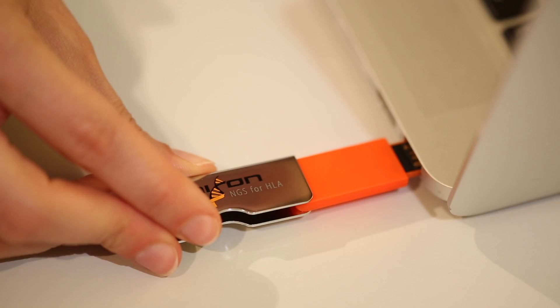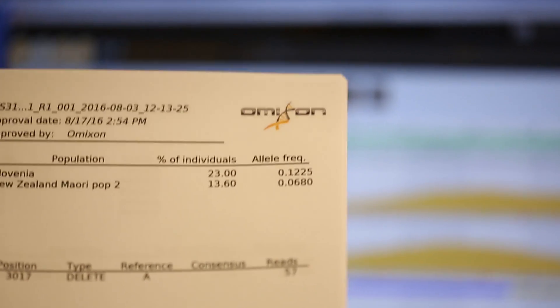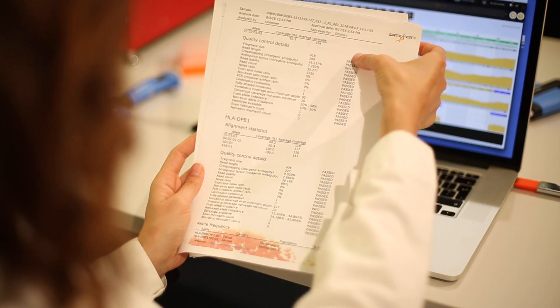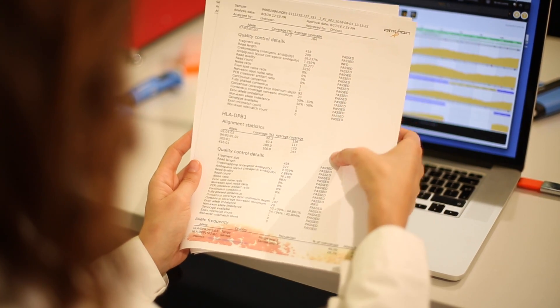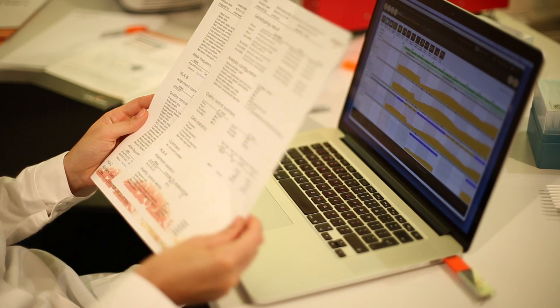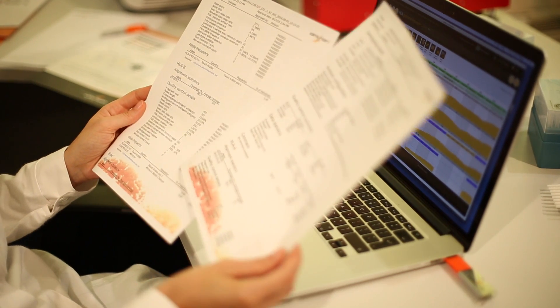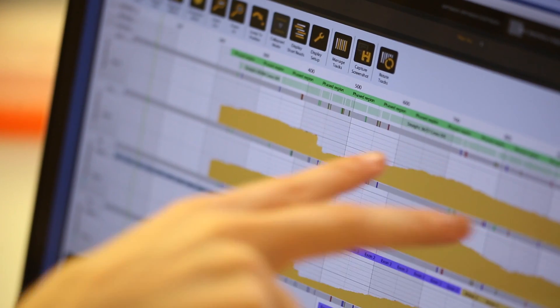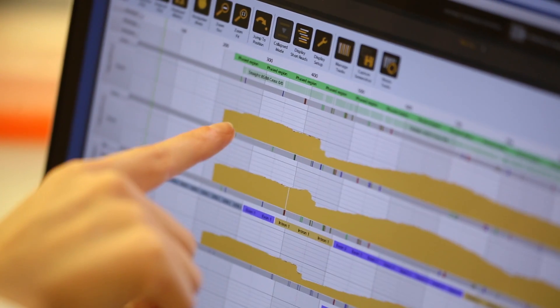Reporting and storing your results with HLA-Explore is easy, as you can export every genotyping call either in HTML or PDF format with fully customised parameters.